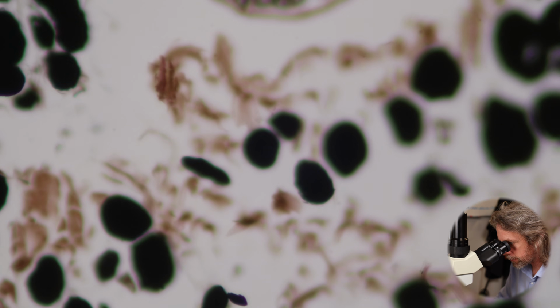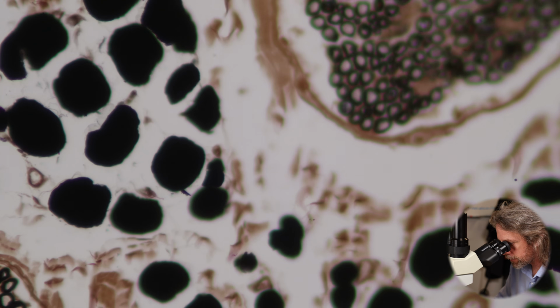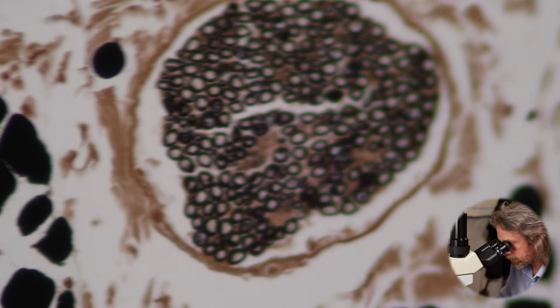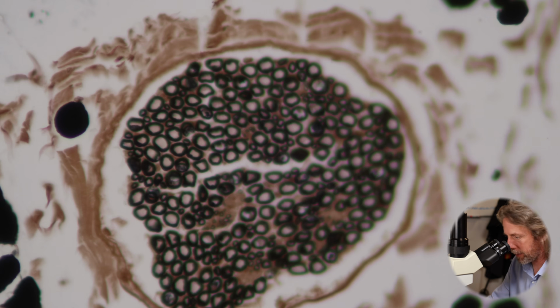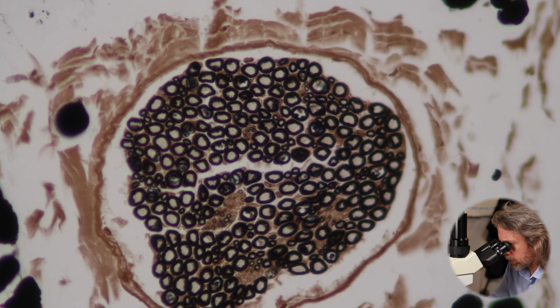Where's it gone? Look at that. So the fat is stained black, and the fat is within the Schwann cell, wrapping around the axon. So now we've got a better idea of the scale and the size of these things that we're looking at, right?